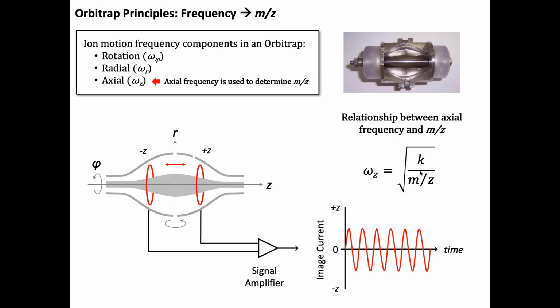So, as I said with TOF, it's destructive. It's not with Orbitrap. You have a lot of flexibility with the Orbitrap. The longer you listen to that ion packet, within reason, the higher the resolving power. If I cut off the time that I listen to that ion packet, I'm going to get lower resolving power. All right? The longer I listen, the better things get to a certain extent, until things start going out of phase and bad things start to happen, which we're not going to get into. But between 0 and 1 second, that's essentially what you're dealing with.